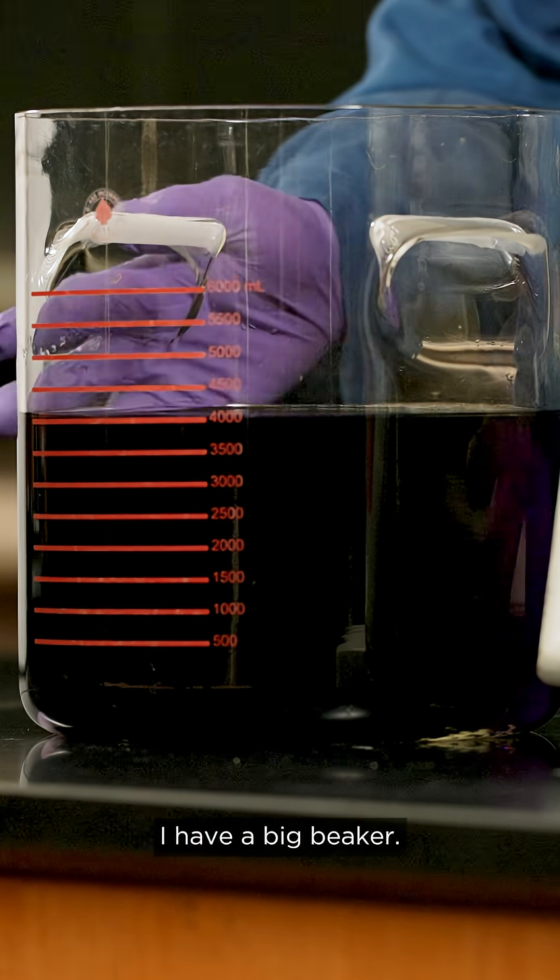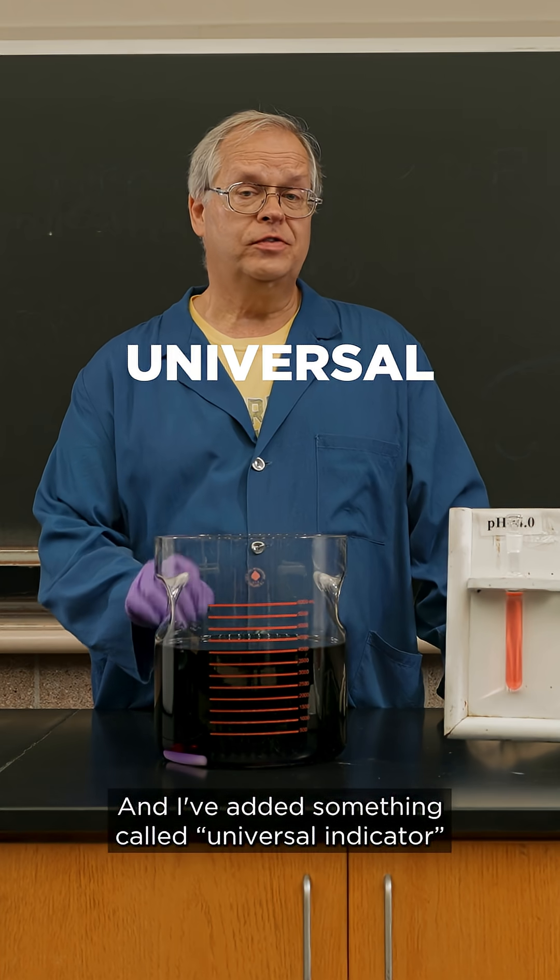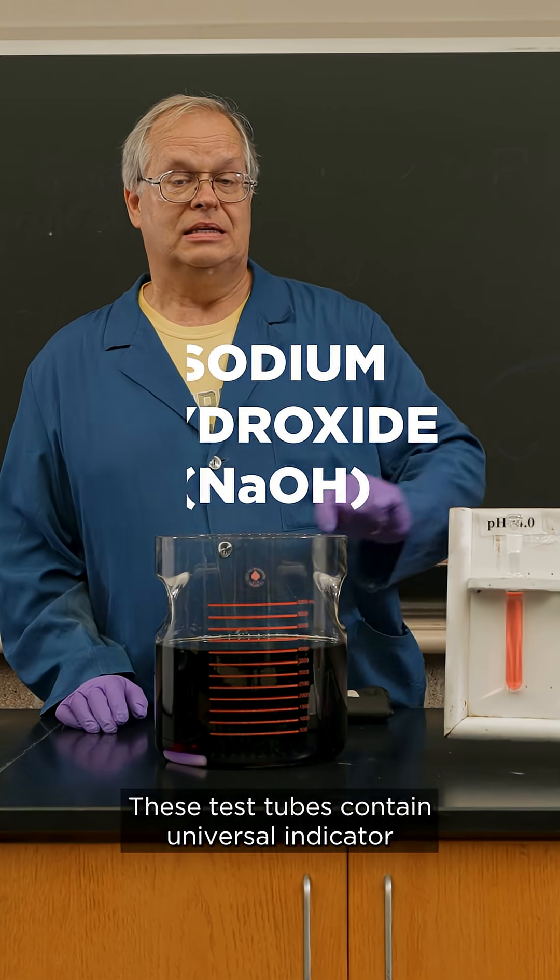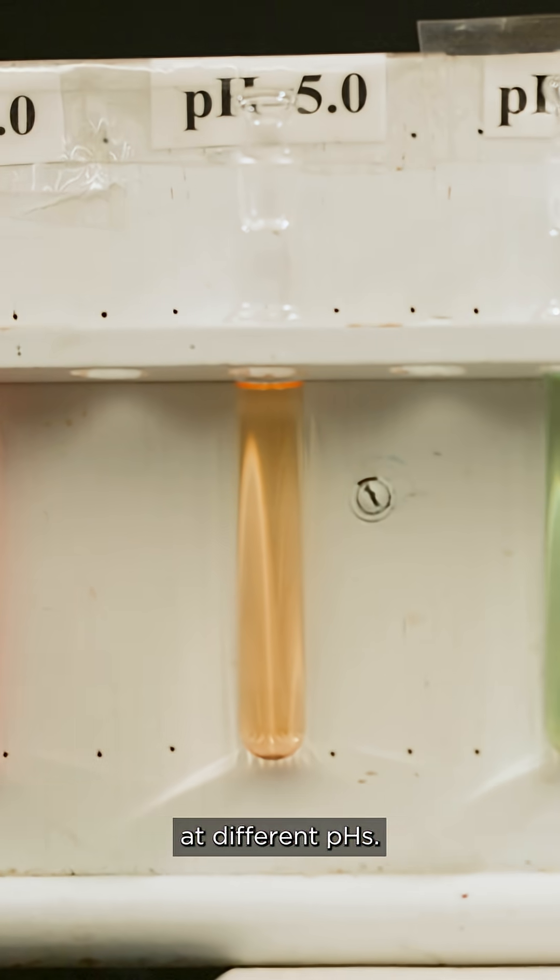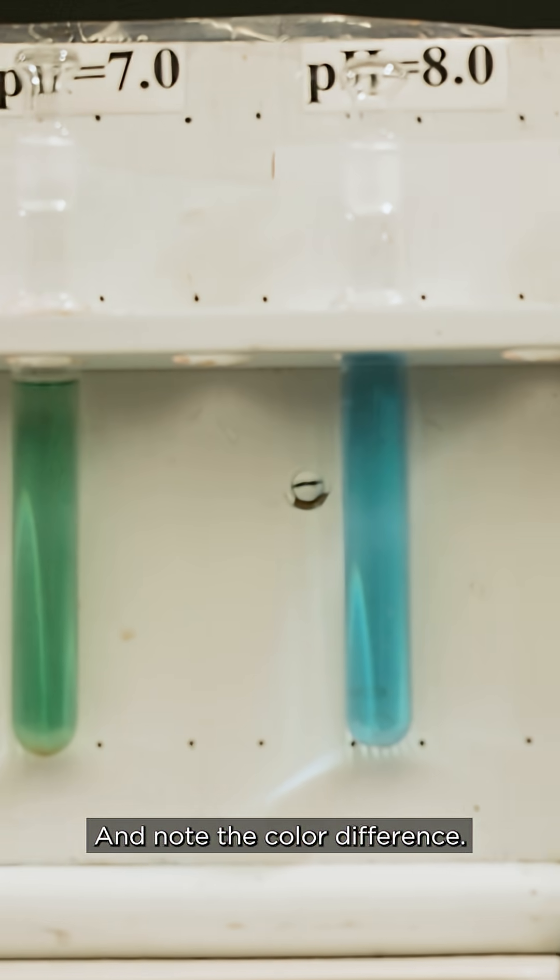I have a big beaker, it's filled with water, and I've added something called universal indicator and a little bit of sodium hydroxide. These test tubes contain universal indicator at different pHs, and note the color difference.